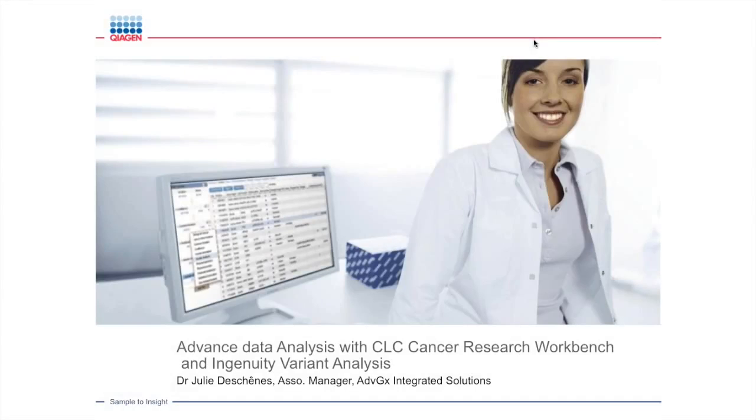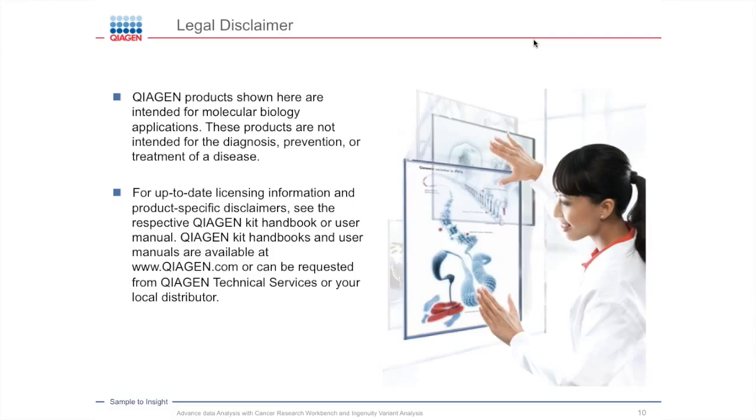Today, we will be talking about advanced data analysis with CLC Cancer Research Workbench and Ingenuity variant analysis.